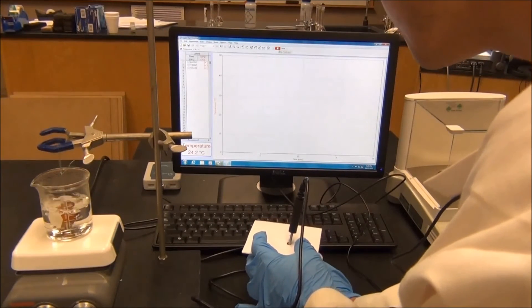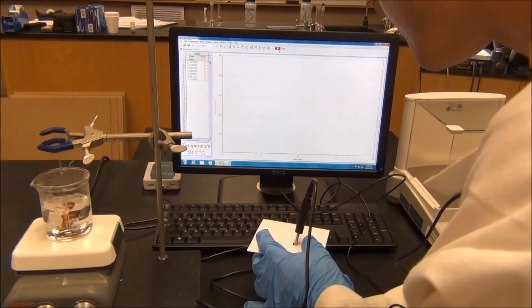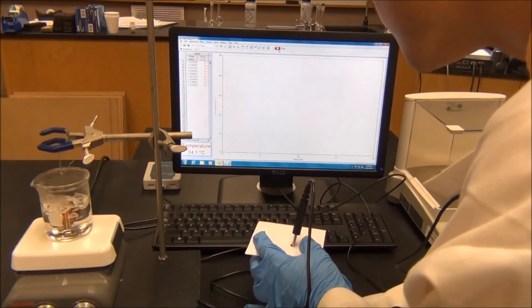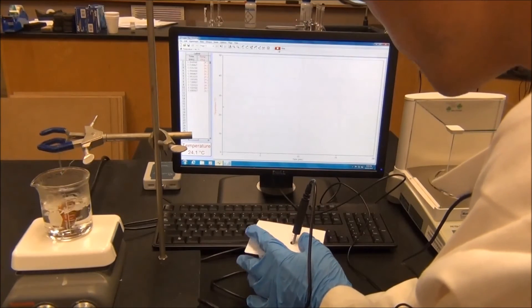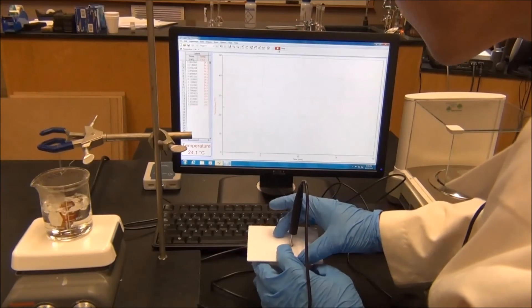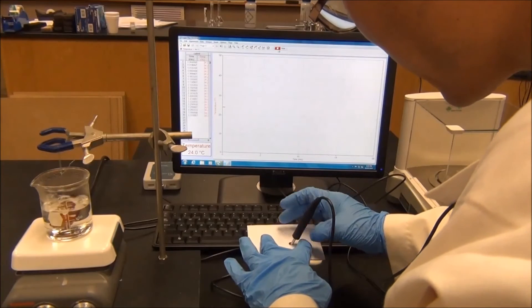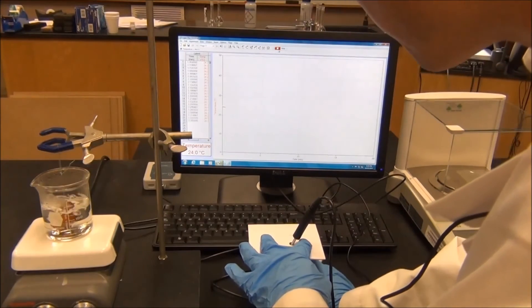Then the reading will be recorded. We need to monitor the temperature until it shows a constant reading. Because it is water only, it is at room temperature. It will take a very short amount of time.